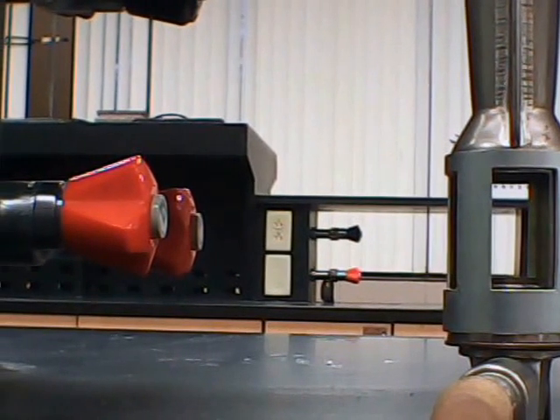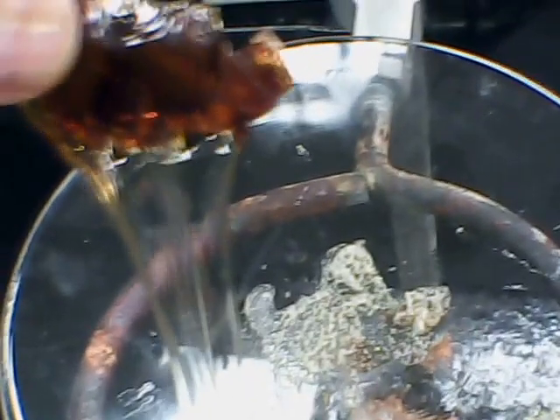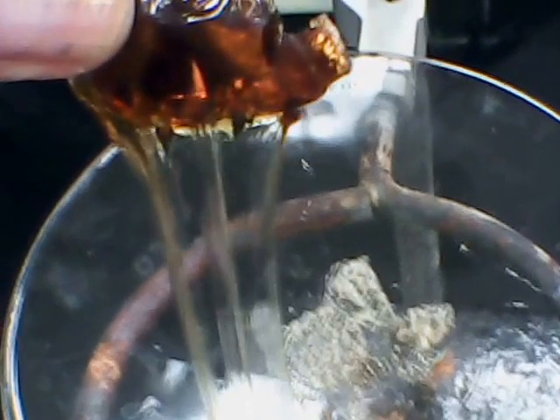There we go. Let's see if you can see. I'm well above the glass transition point, which is down around room temperature or so. And that's softening up nicely into a nice film.